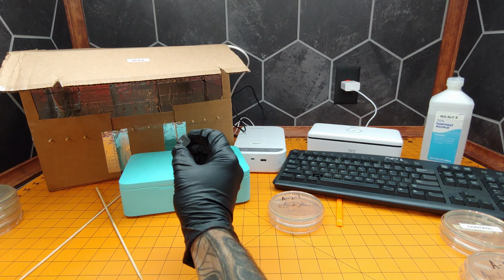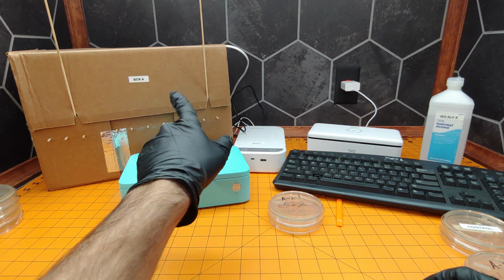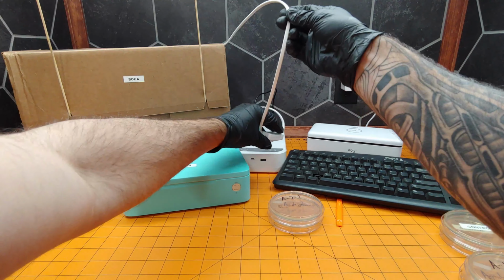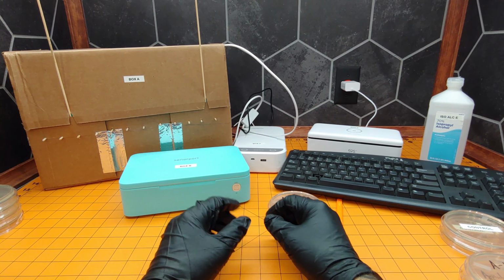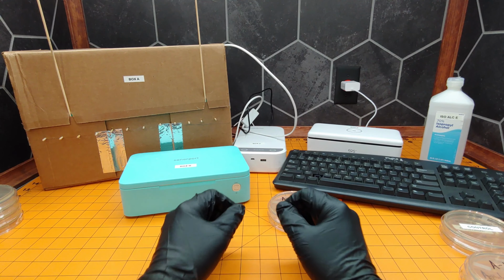We'll use this as our base plate because it is also shiny. We have the top of the key facing up directly toward the light. We'll seal this off. Don't mind that cable. And we're going to run this for 1 minute. All right, it's been 1 minute.